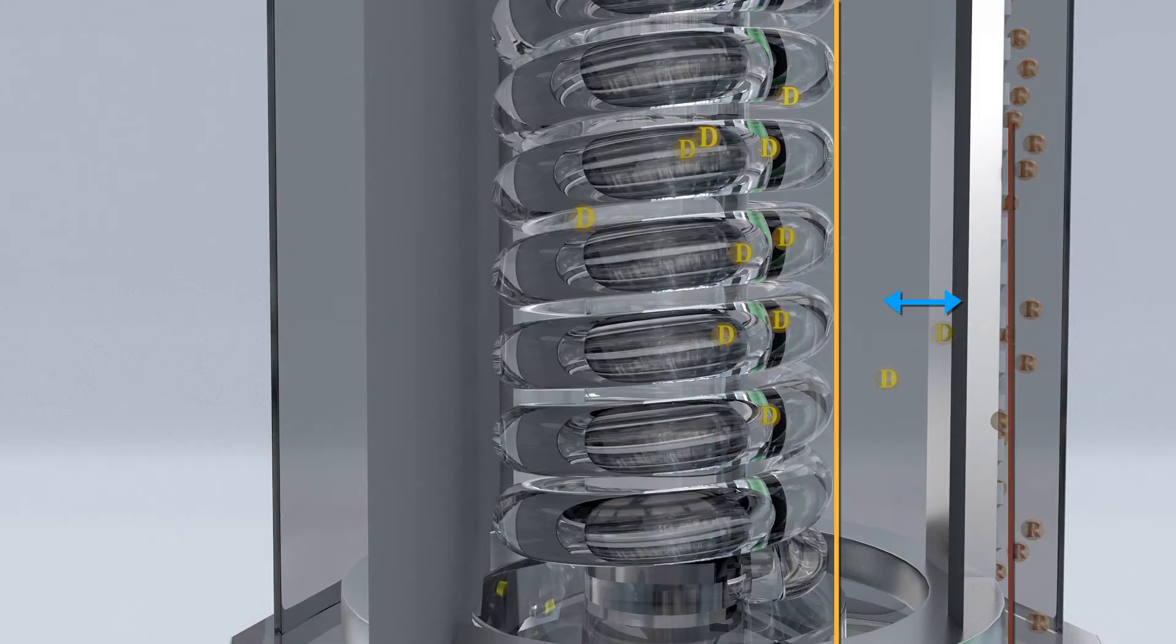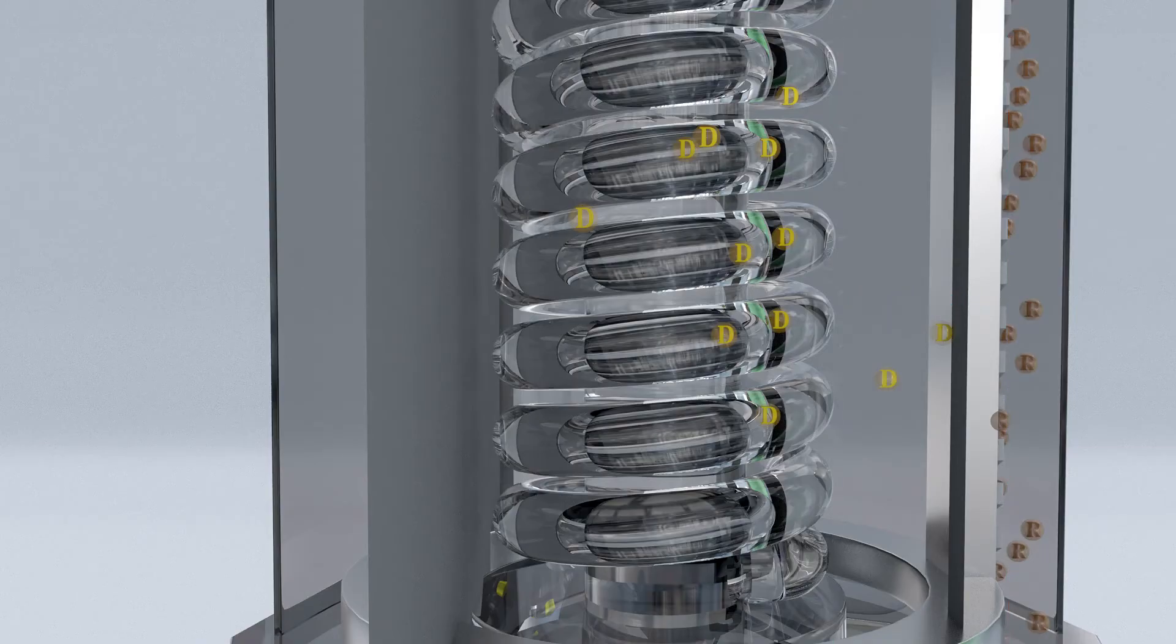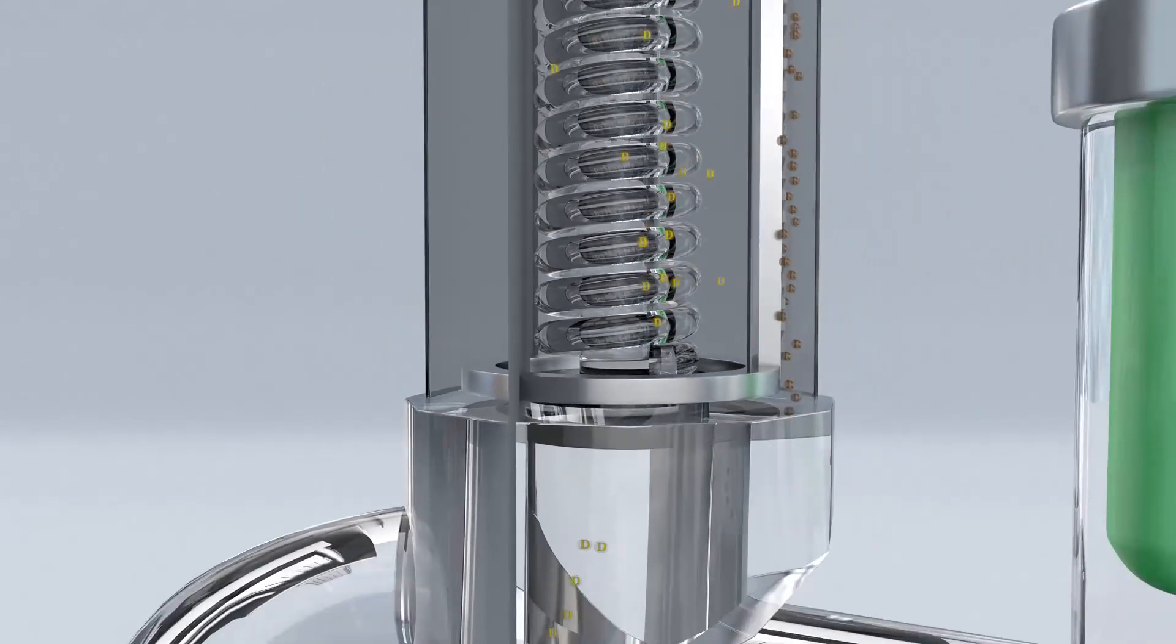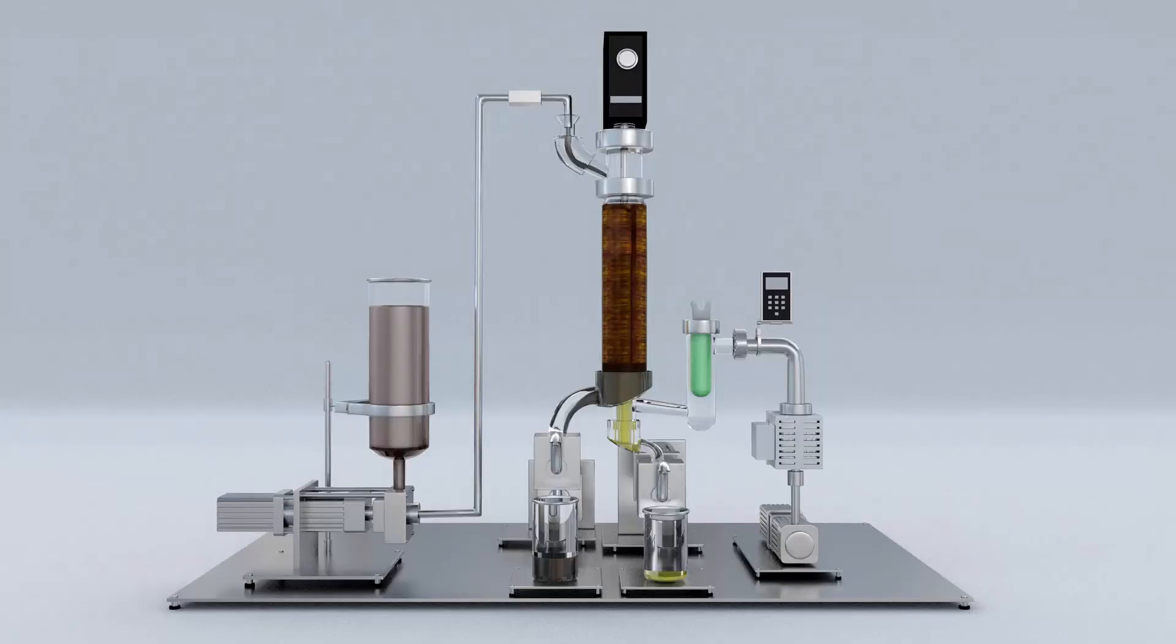The distance between the evaporator surface and the condenser is sometimes referred to as a short path, which helps ensure product quality since the distillate is only in a vapor phase for a short period of time which reduces the chance of breakdown or oxidation.